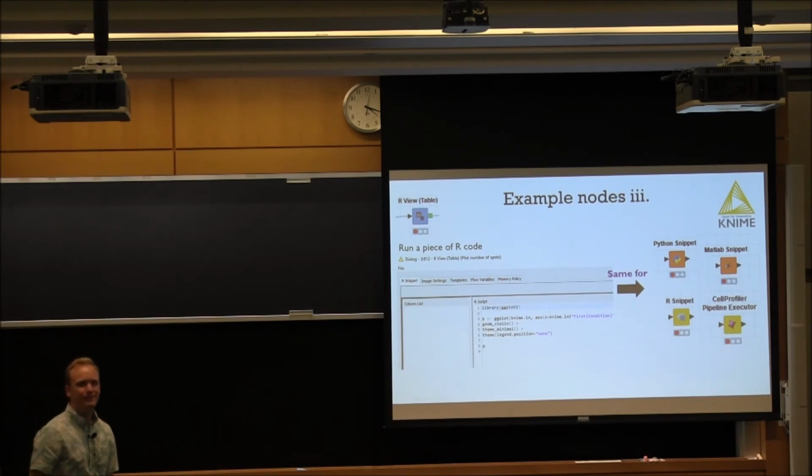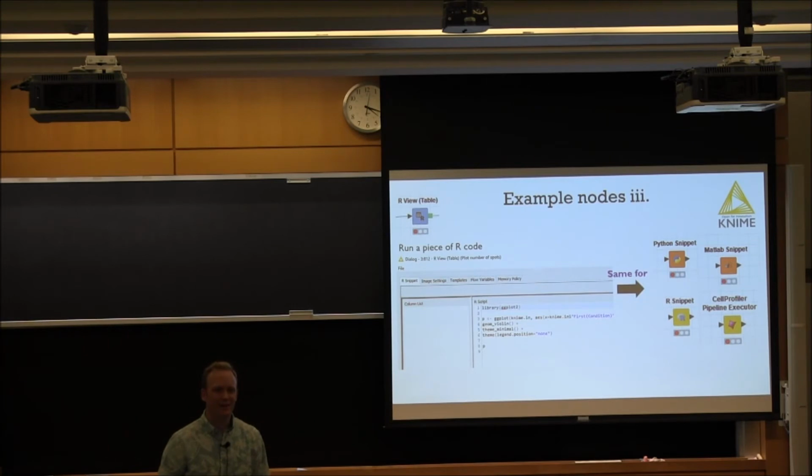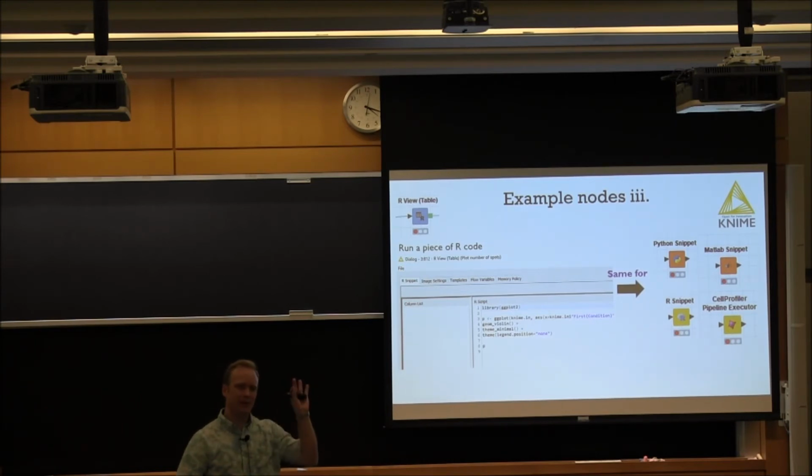But maybe. I had a curiosity, how does it call all these instances of different programs? Do you have to have the programs open? You don't have to have them open. You need to have them installed, and then in KNIME you can set up some configuration settings. Say I want to use it with MATLAB. There's a configuration setting where I tell KNIME where my installation of MATLAB is, and that's all you need to do. You don't need to have it open. It's going to call it headless.